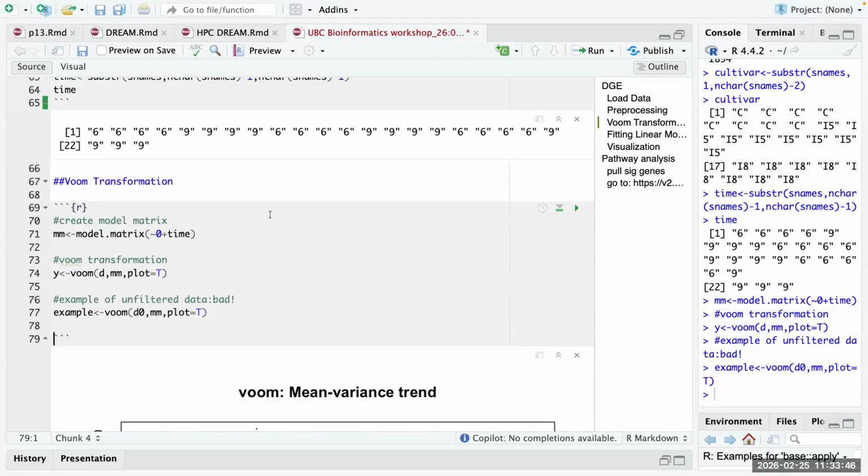Oh, okay. We have a question in person here, just to reiterate it. She was asking for the meanings of the variables. What does cultivar mean? What does time mean? What does replicate mean? Cultivar is the type of plant. I'm not a plant expert, but you can just think of it as flower A, flower B, flower C. Time is when they're sampled.